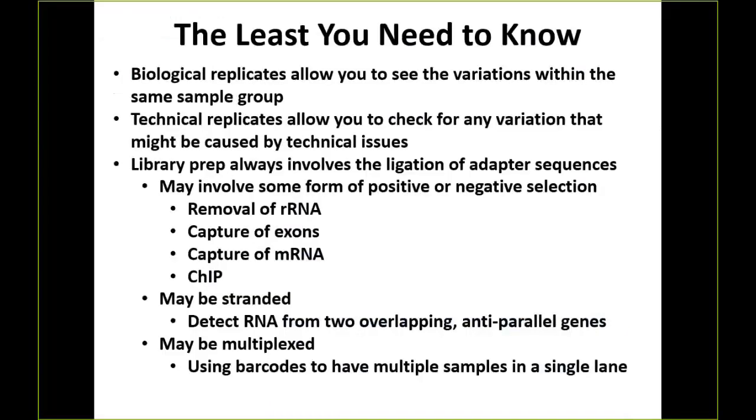All right, so what's the least you need to know for library prep? Biological replicates let you see the variations within the same sample group. Biology is very noisy. You're going to want a lot of biological replicates.